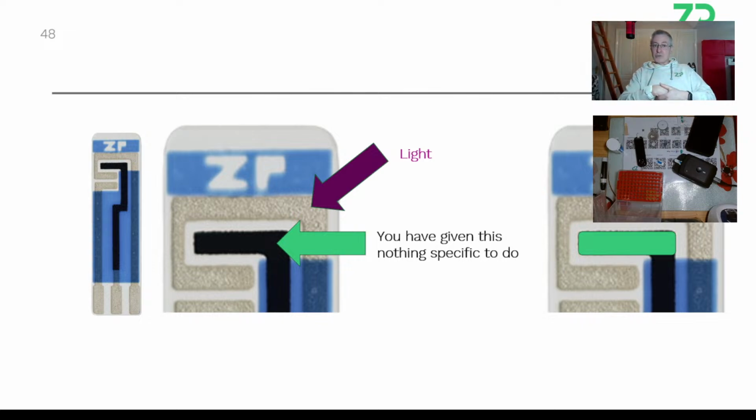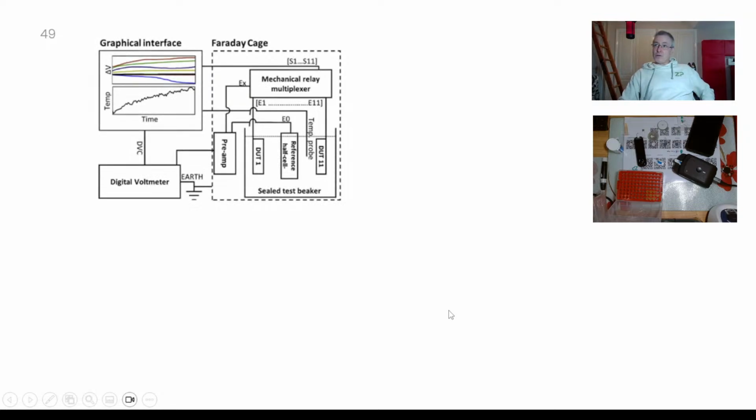Actually, by the time you use this carbon electrode, let's say, it will already be sitting underneath your material. So you will have built specificity. So you really need to be assessing the stability of the sensor that you make, not the underlying material at the moment. But at ZP, we have done this kind of work in the past.